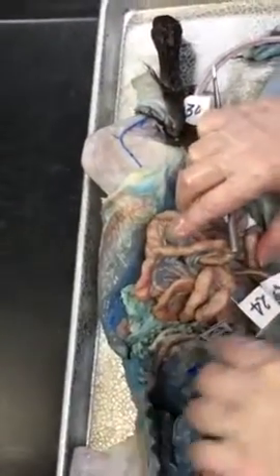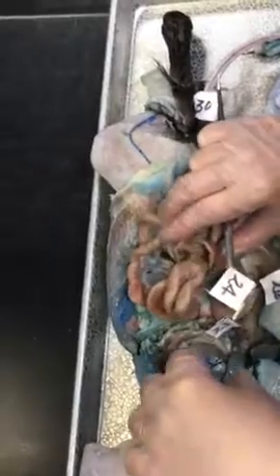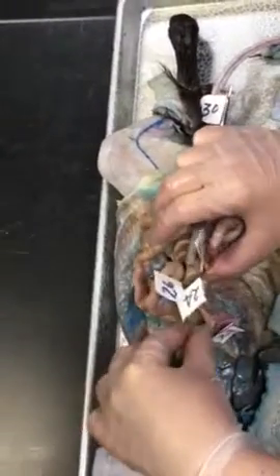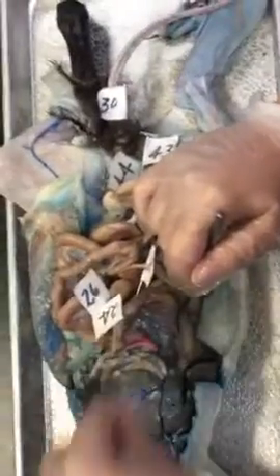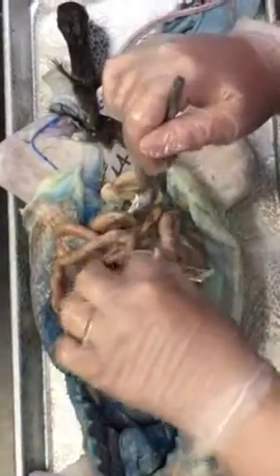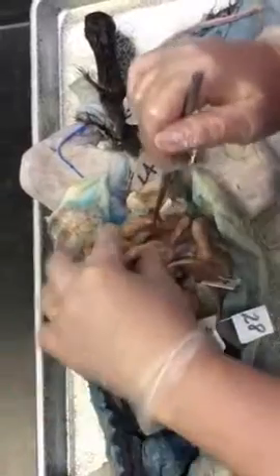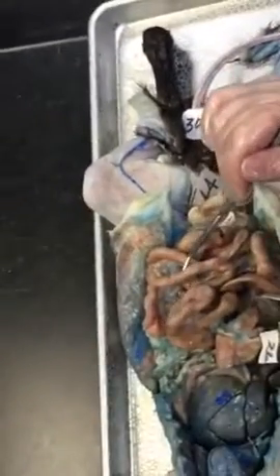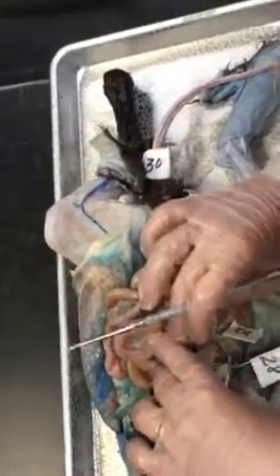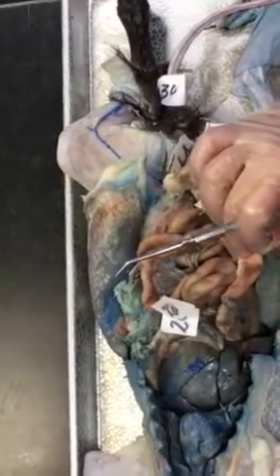Okay. But you need to know the three regions of the small intestines, and when I ask for the region, the question will say, name the region. So if I pin the small intestines near the stomach, that will be the duodenum. If I pinned it out here randomly, just anywhere in here, that would be the jejunum. And if I pin it close to the large intestines, then that will be the ileum.